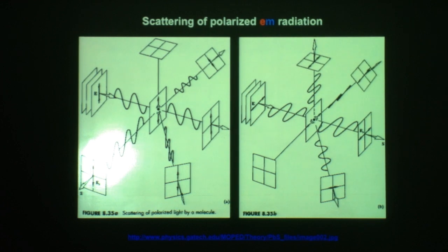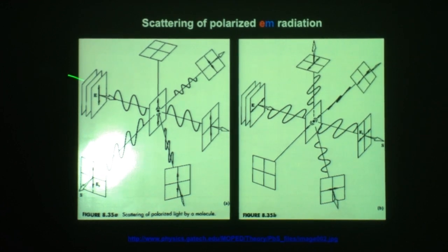Okay, so now let's consider this. How is this going to look? If we have incoming radiation hitting our electron, its vertical component is going to set the electron into this kind of motion, so the transmitted beam will also have the vertical oscillation. But normal to that, along the y direction, we would have also a vertical component, and off in some general direction, of course, the cosine 2 theta factor would reduce this amplitude.